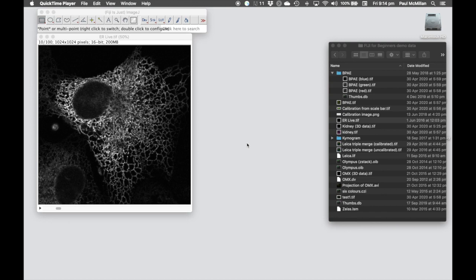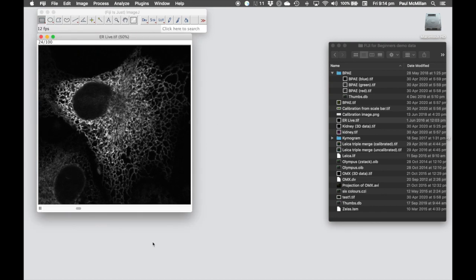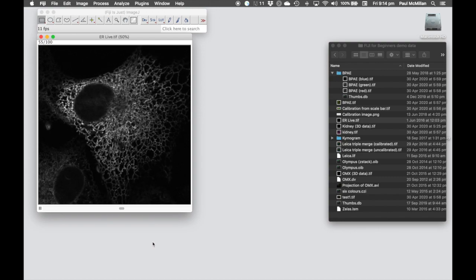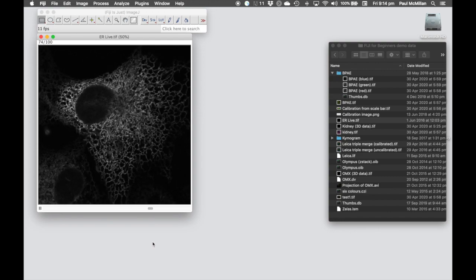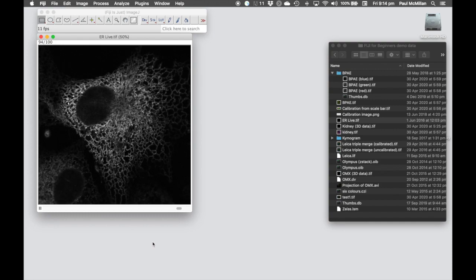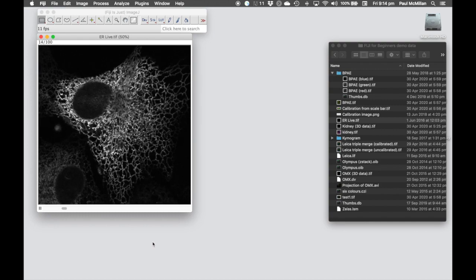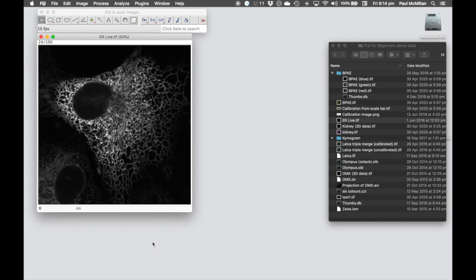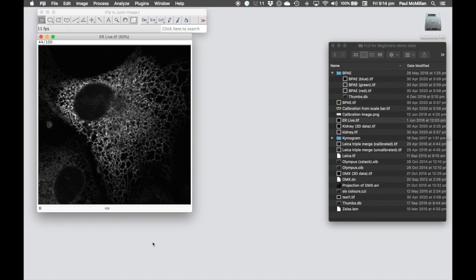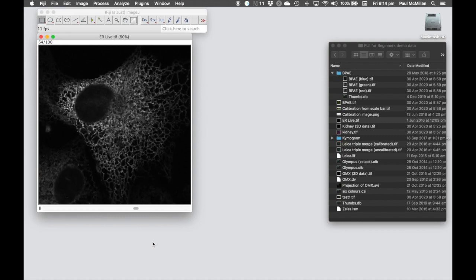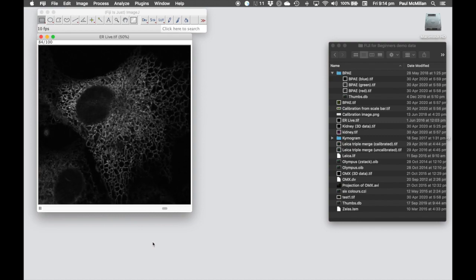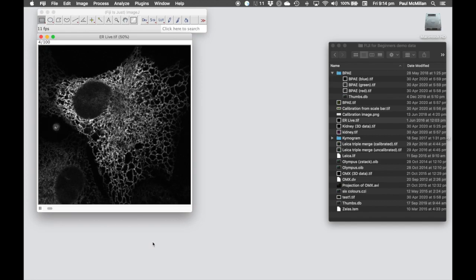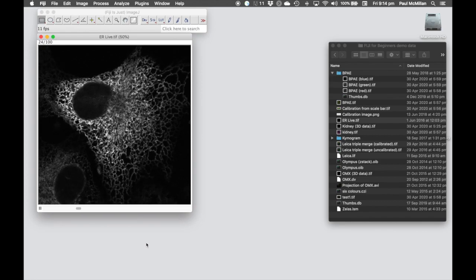There is one issue though with the movie that we're creating here. Similar to when we were adding the scale bar to give distance information and calibration bar to allow people to interpret the colors, we have no idea of how long this movie lasts for and what each of the time points are. So we need to annotate this movie to allow the people watching understand the time lapse of the actual acquisition.